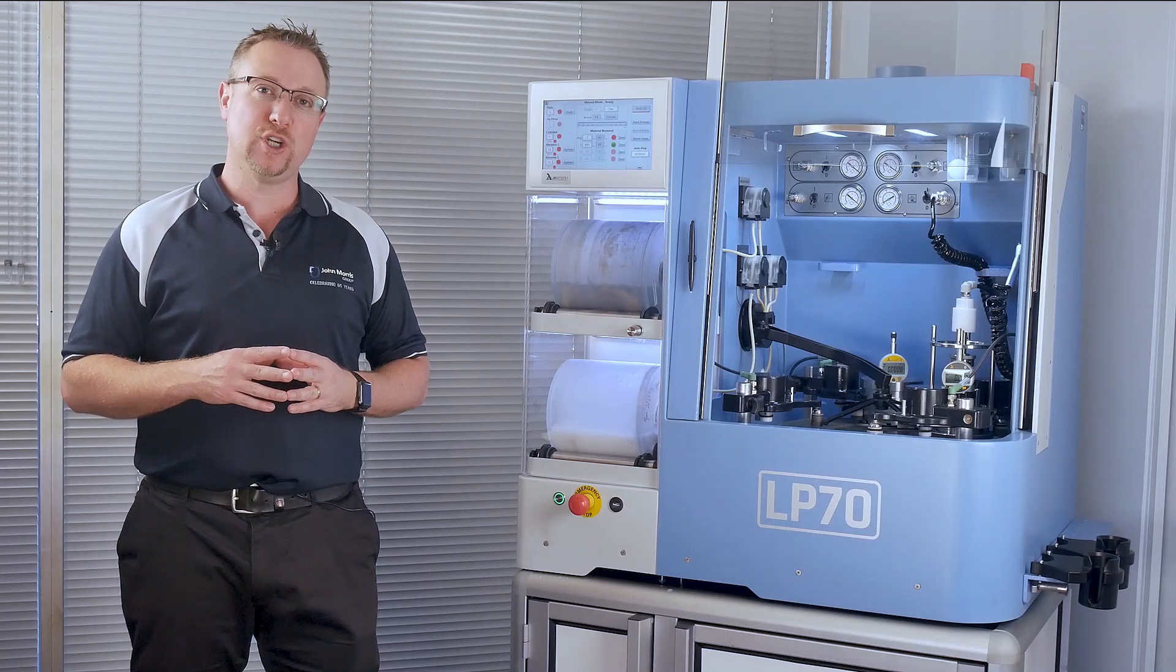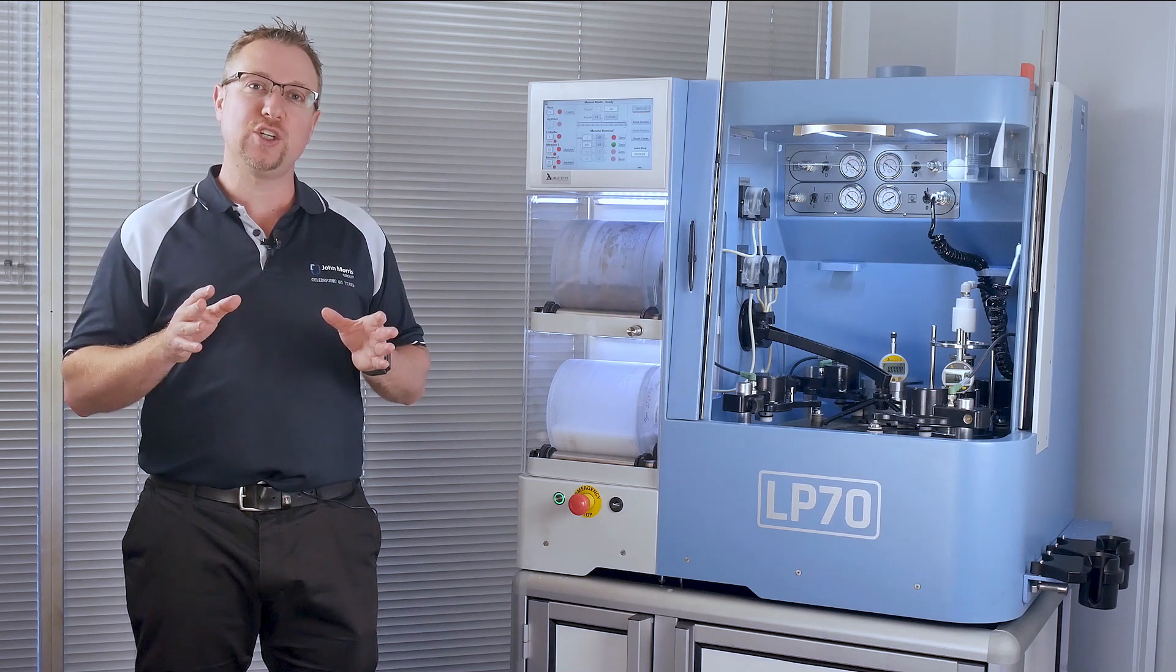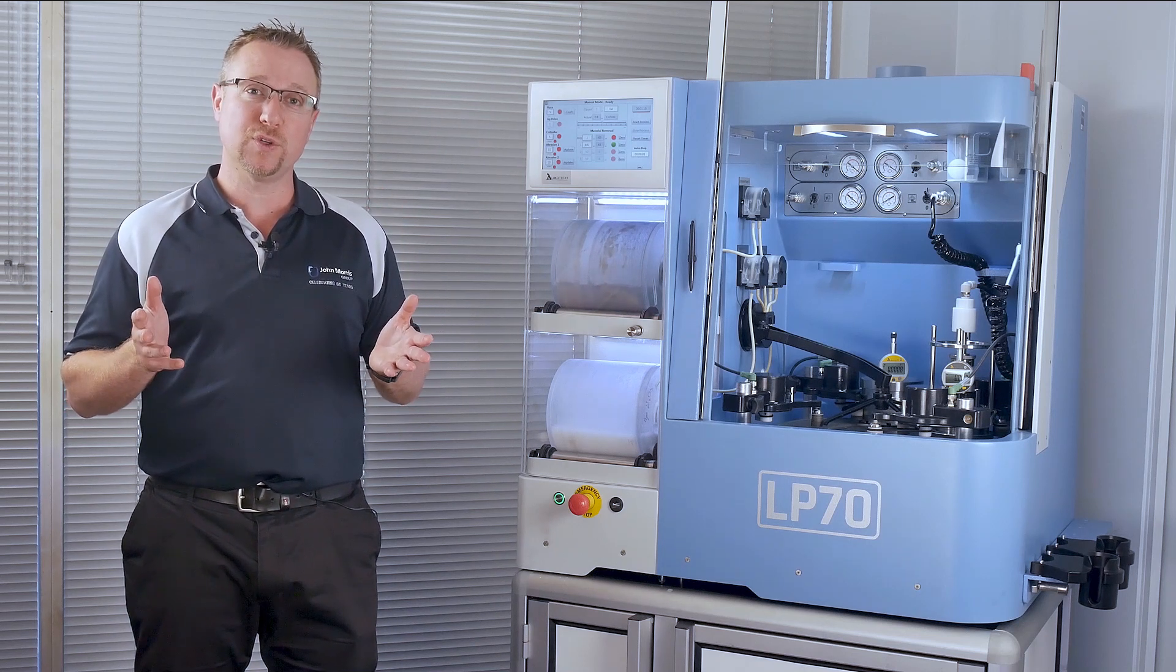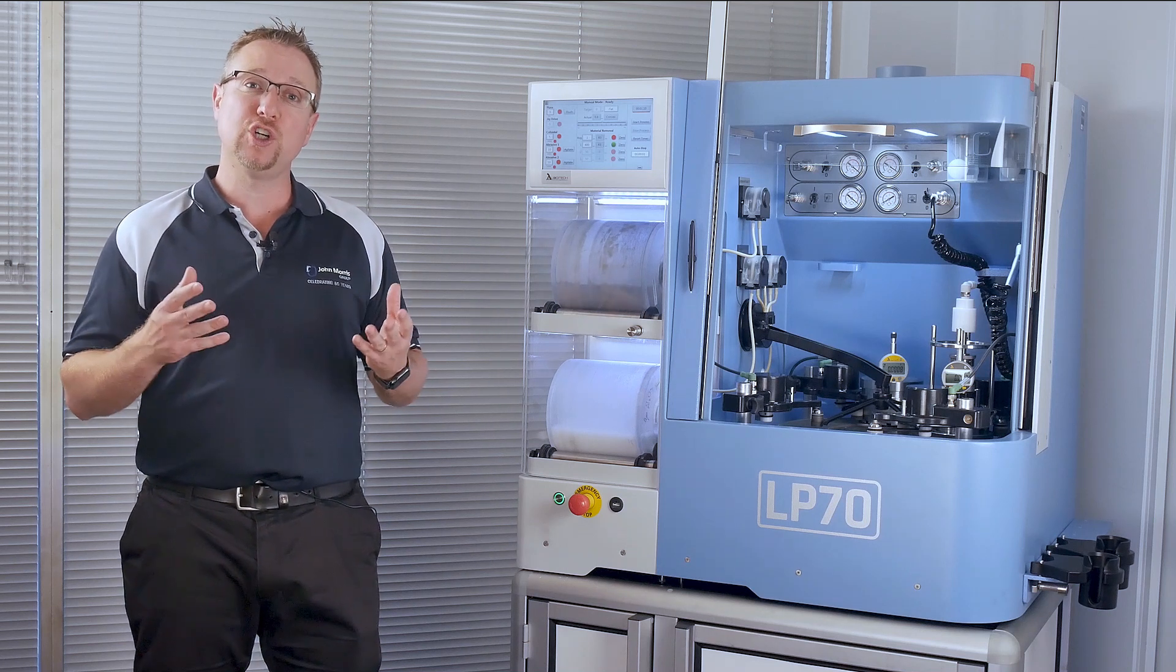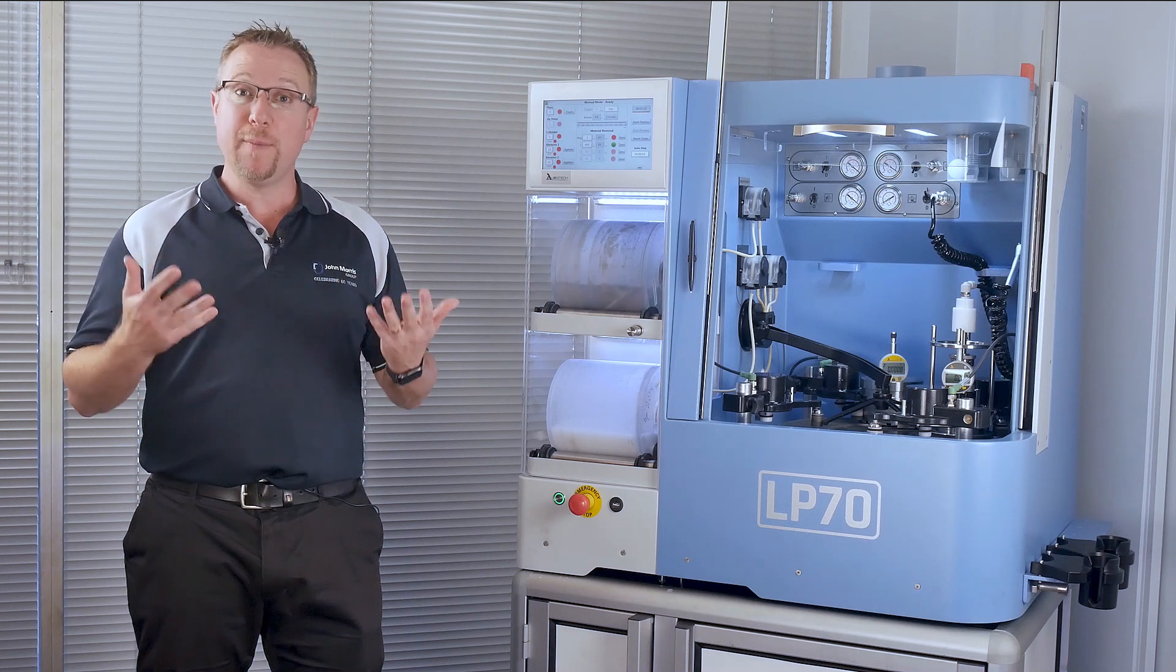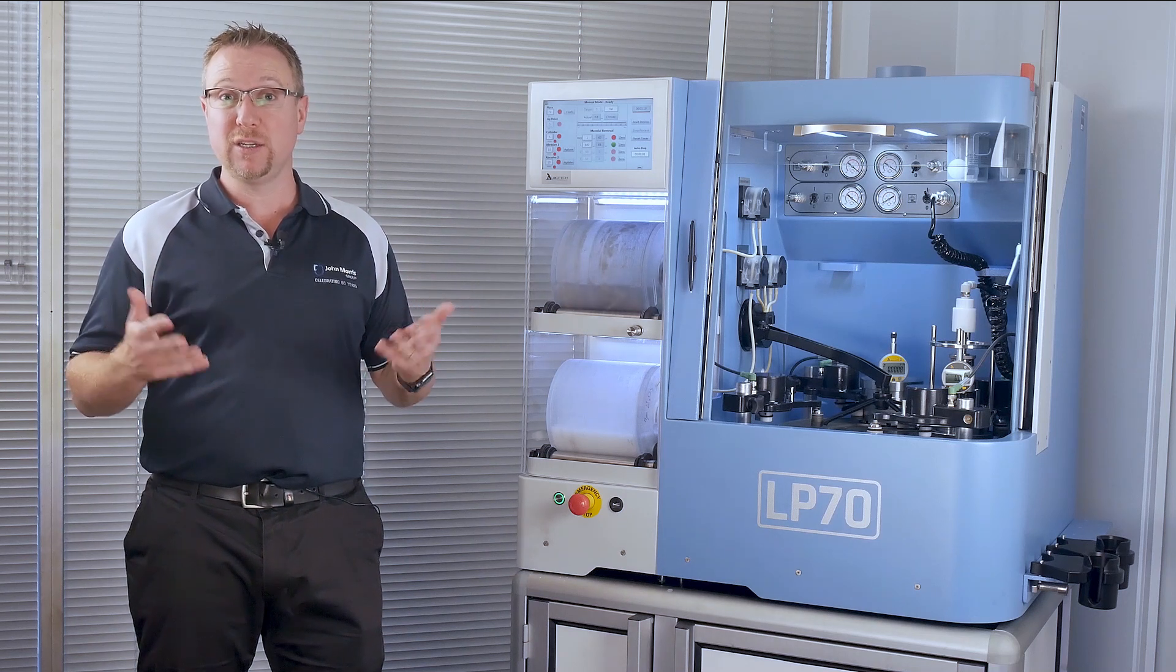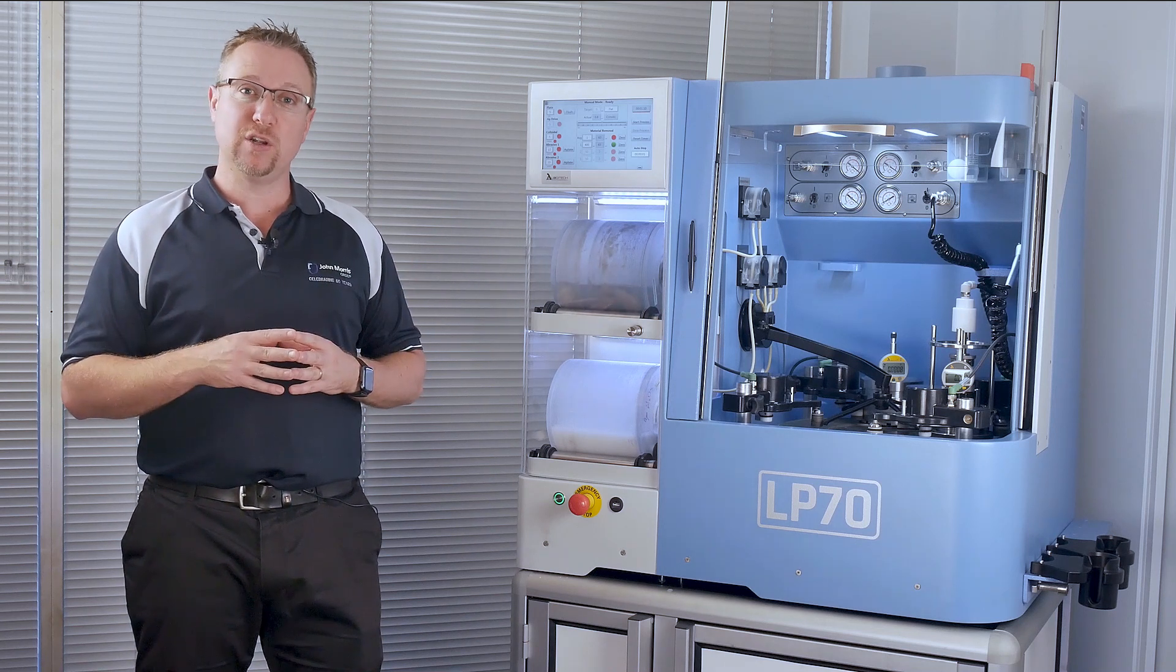We are incredibly proud to work with Logitech, global leaders in this field. They provide systems for sawing, dicing of rocks and other geological samples. They also provide wafer bonding for the semiconductor industry, lapping and polishing of both geological samples and semiconductor applications, chemical-mechanical polishing of semiconductors, chemical-mechanical de-layering and planarization, as well as chemical polishing and solutions for semiconductors.